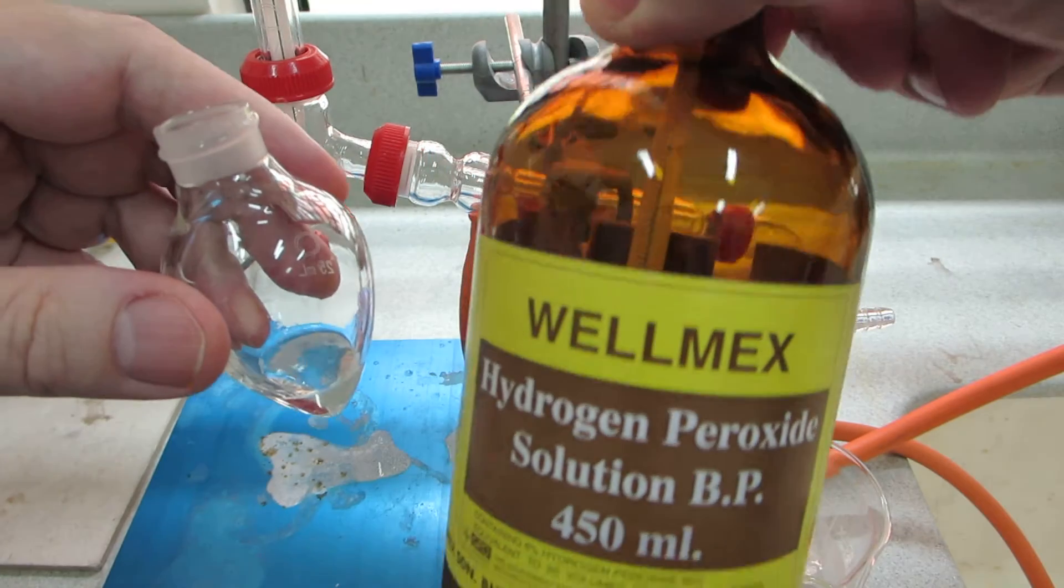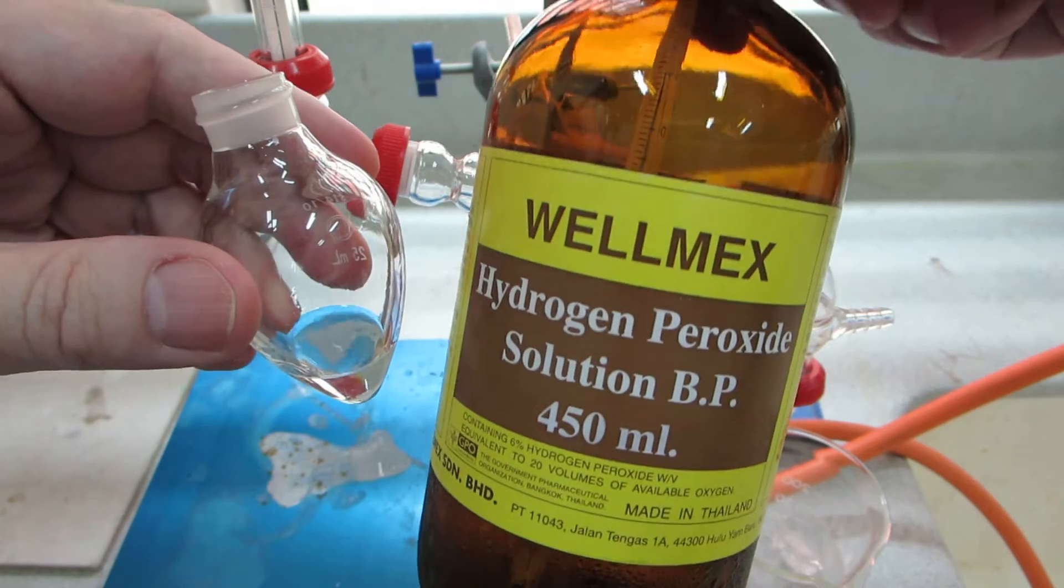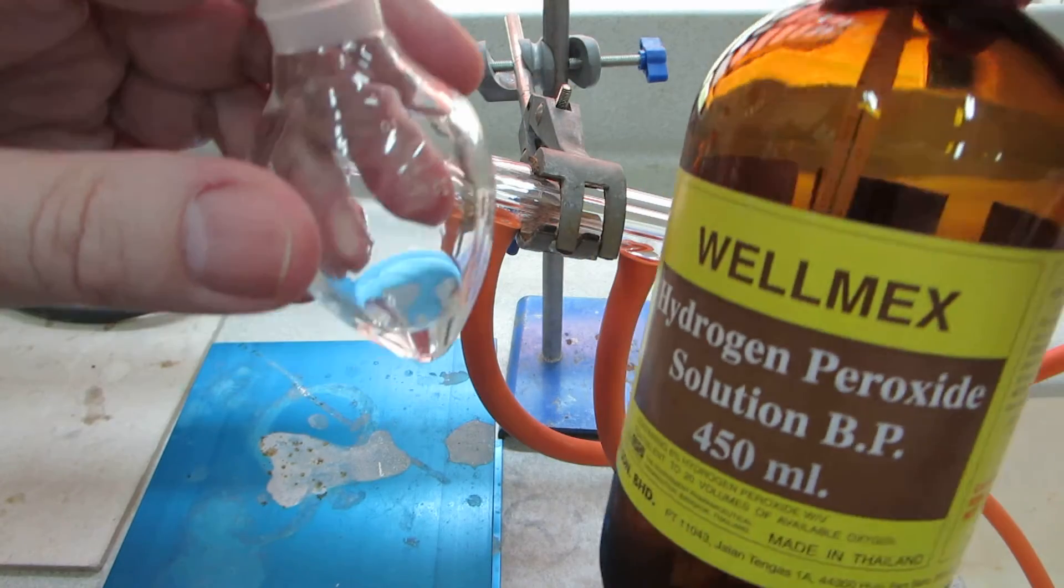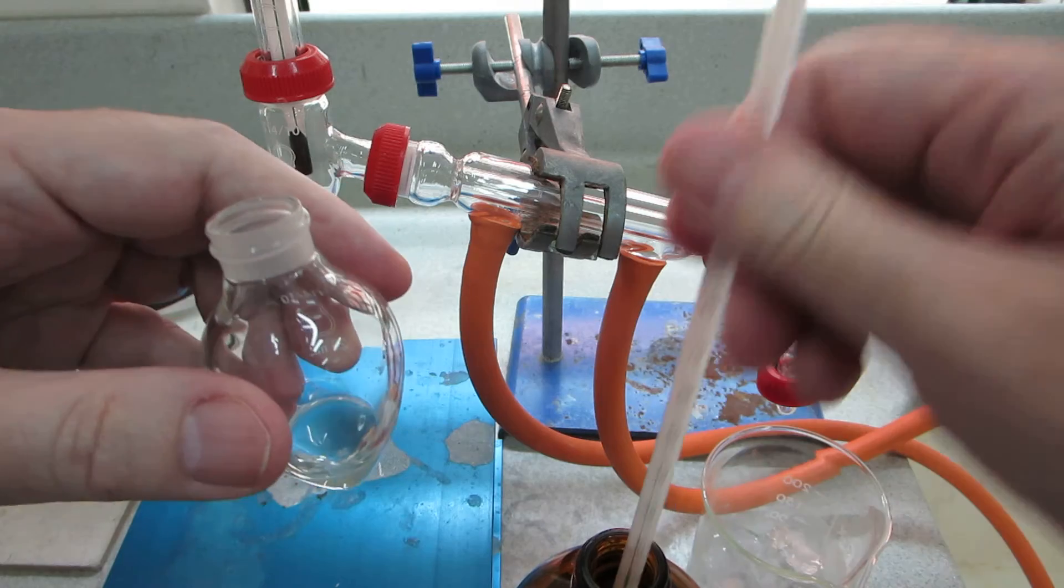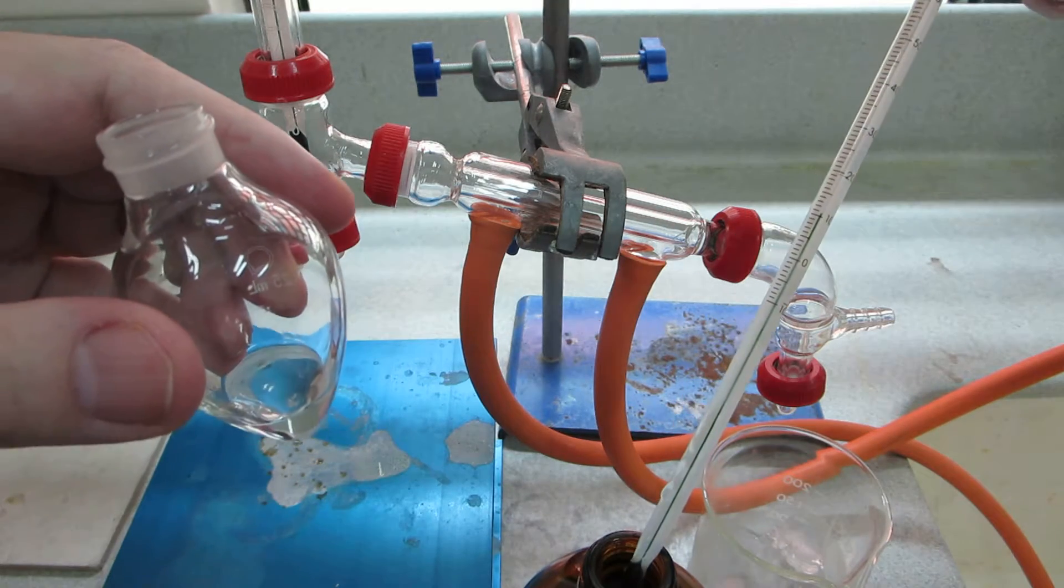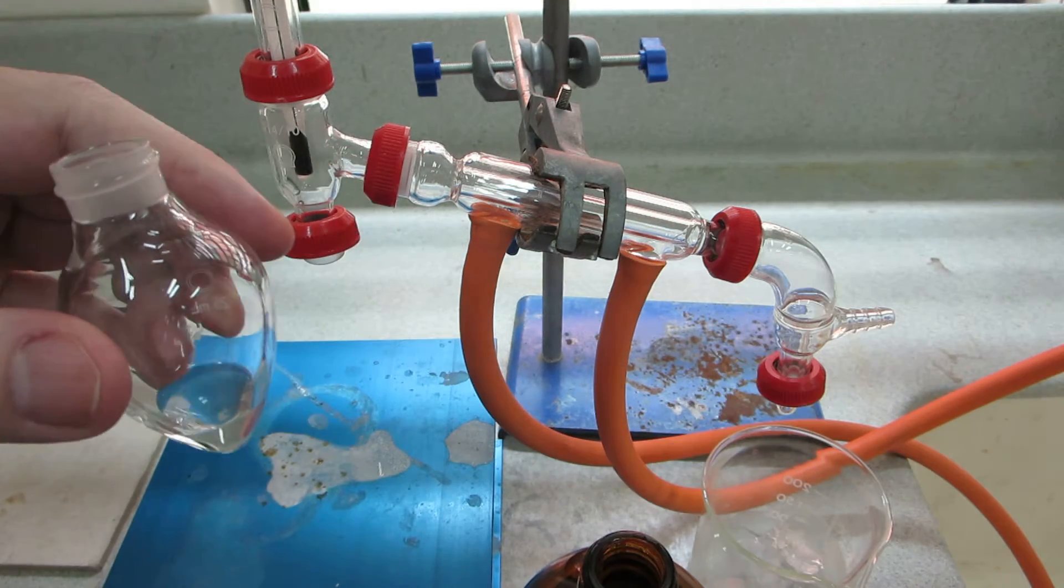Well here's the hydrogen peroxide, this is 20 volume hydrogen peroxide. At the moment there's a thermometer reading the temperature, it's at about 11.5 degrees centigrade.